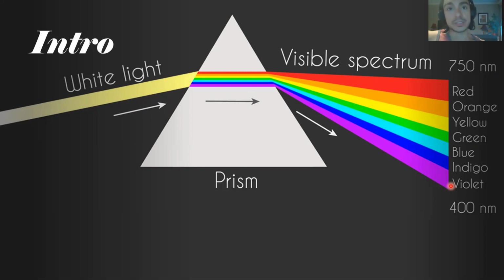For instance, a solution sample that absorbs light over all ranges of the visible spectrum, i.e. it transmits none of the visible wavelengths, appears black in theory. On the other hand, if all visible wavelengths are transmitted, i.e. the sample absorbs nothing, the solution would appear white.